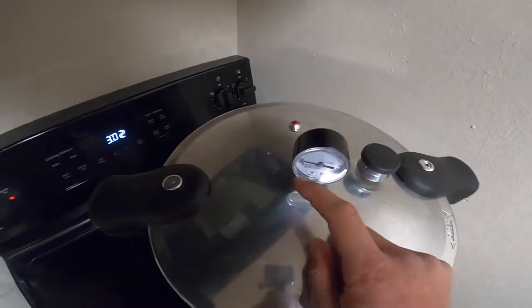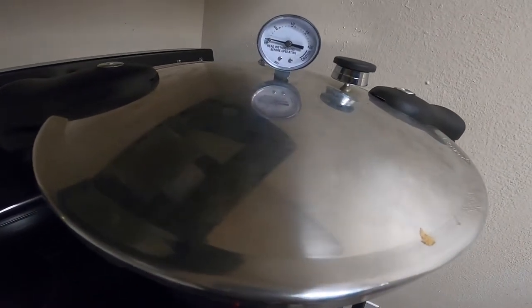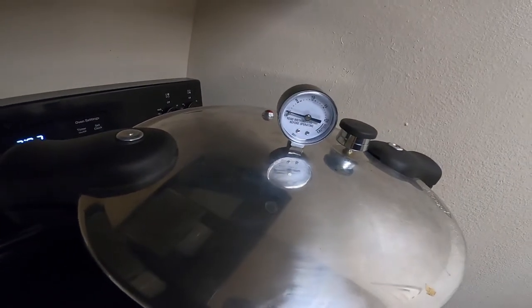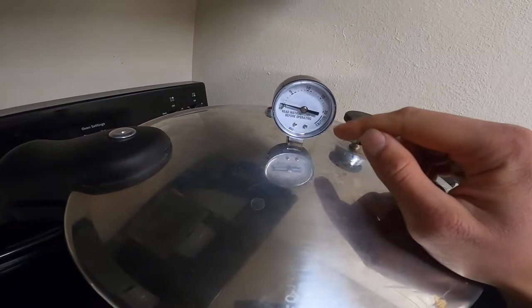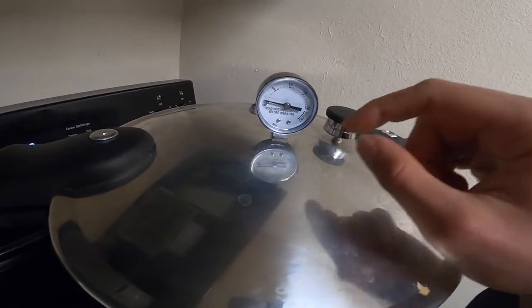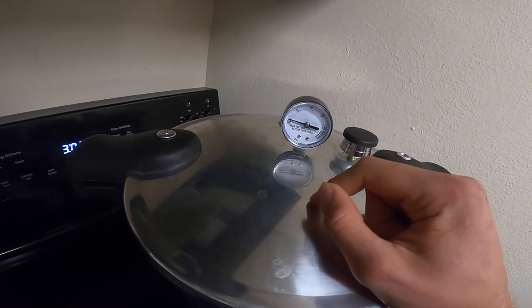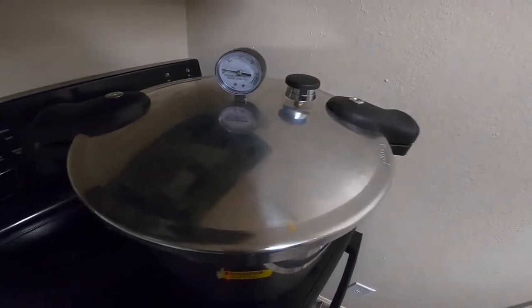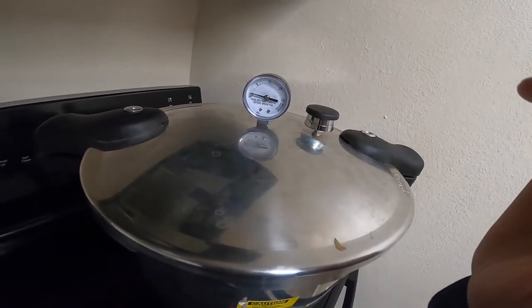When you're sterilizing something, generally the higher the pressure the faster it's going to sterilize. But since this is not the weighted topper, I cannot go too high in pressure or else steam will leak out. I'll lose steam and run the risk of running my pressure cooker dry — and if you do that it will combust and explode, which could result in injury or even worse. So when doing this with a regular household pressure cooker, you really need to keep an eye on it at all times.